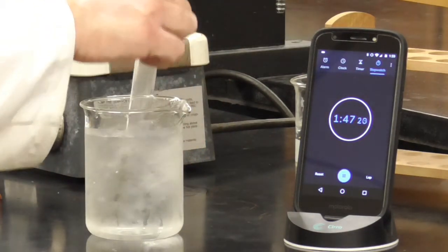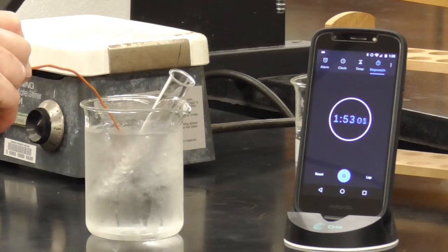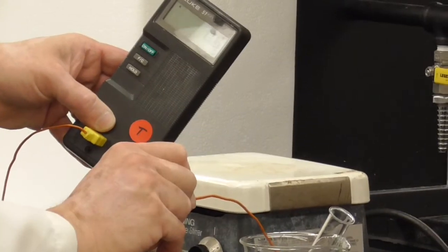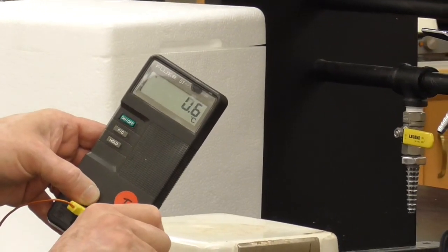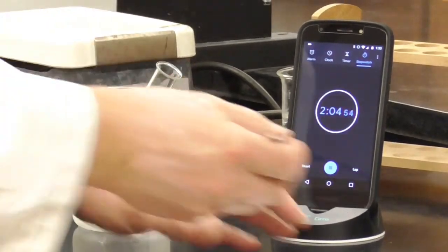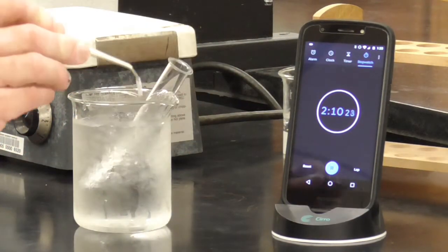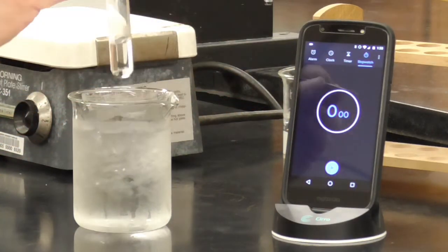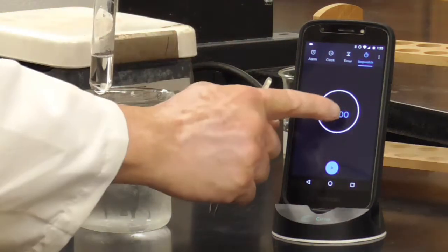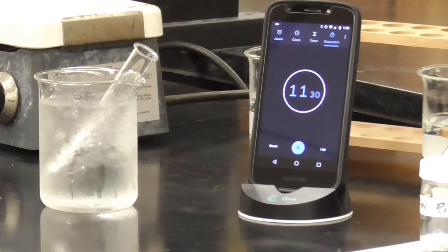Lastly, we've got the test tube that's been in the ice water. And check the temperature of that. As expected, we're almost right at 0.6 degrees Celsius. Our last piece of zinc. Go ahead and take that and, whoops, I forgot to get the timer right. Reset it. All right, I'll drop it in. Hit the go button. It's just barely bubbling, as you can see here. So let's go ahead and put it back in and we'll let that react.